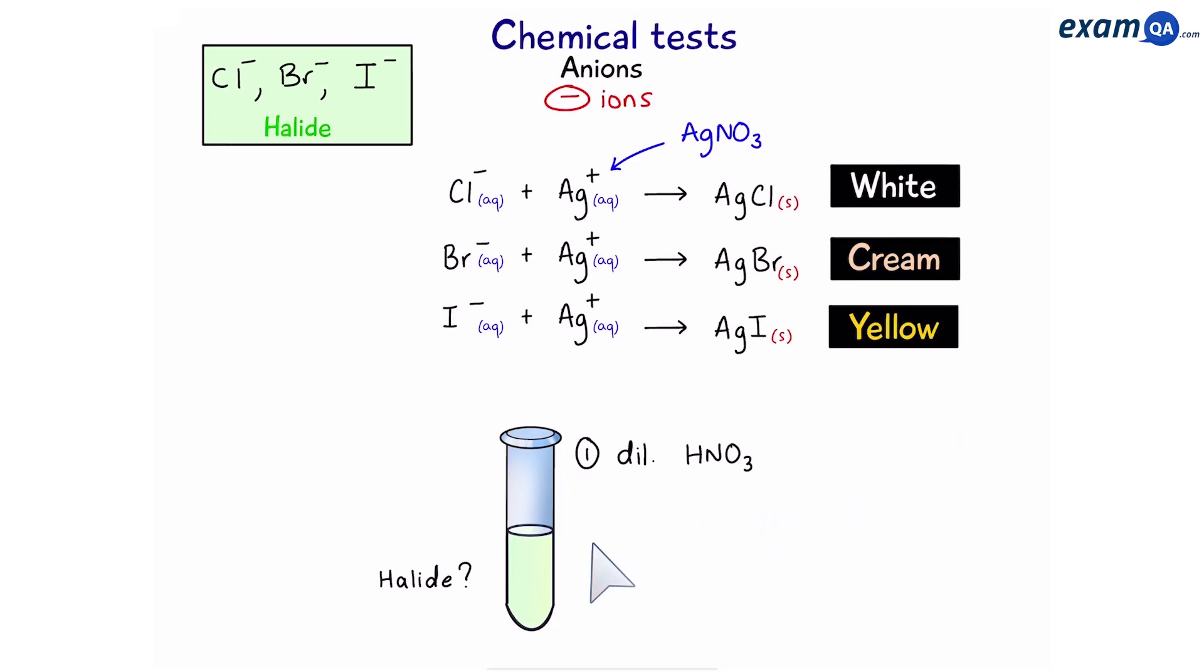Okay so we've removed impurities. Now we're going to add silver nitrate and then you should form a precipitate. Depending on the color of the precipitate, if it's white it means we had chloride ions, cream means we had bromide and yellow means we had iodide.